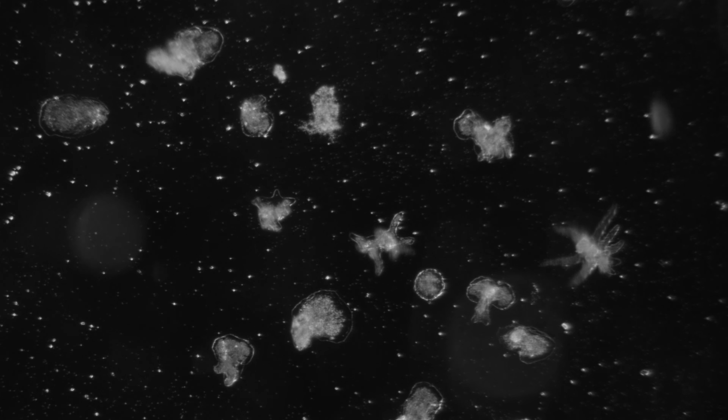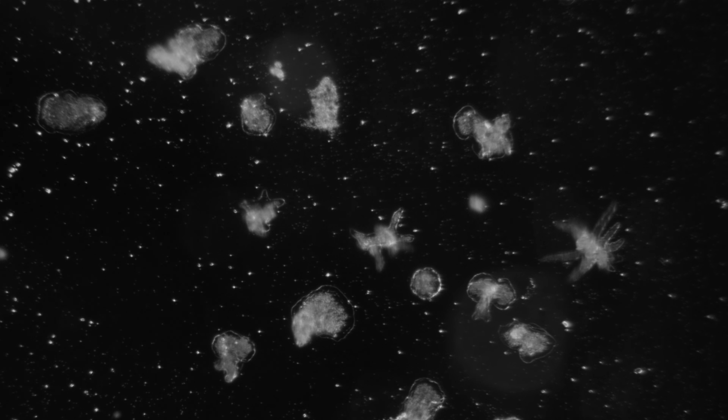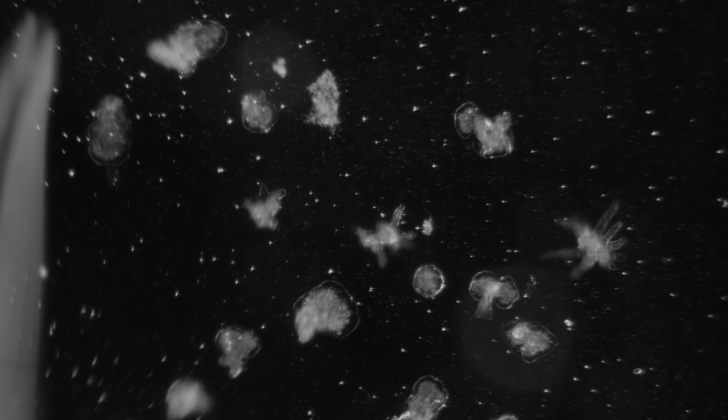I thought if we look at them side by side, you'll see the difference more easily. So here is some of today's crop before washing. I point with the needle, so fine to play with them. So you see some of them are in a floating state, like this one.